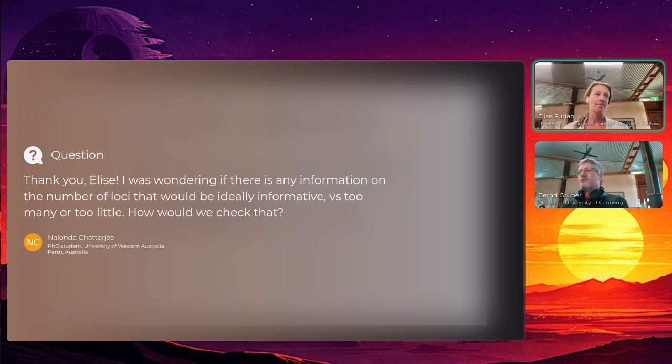Again, it's almost like here you can use R. Basically what you would do is, okay, I take 5, 10, 15, 20, 27, and if you go downwards in numbers, how many you select, you will see that your estimate of FST and the ranking will deteriorate, and then it's your call how much information I want to retain.